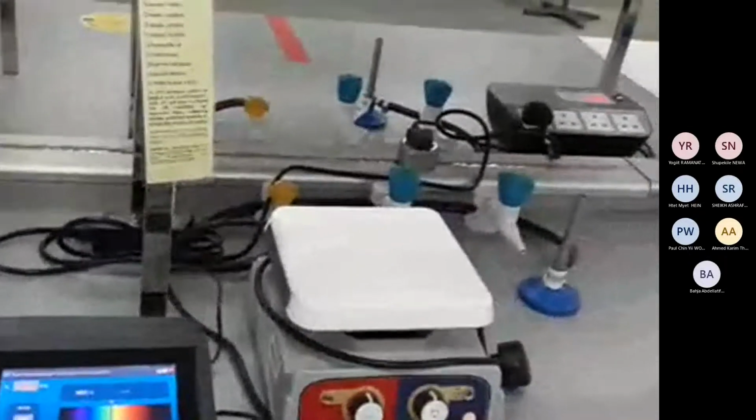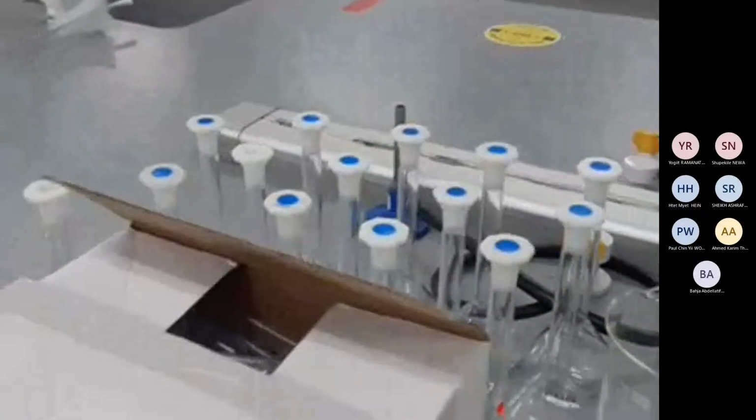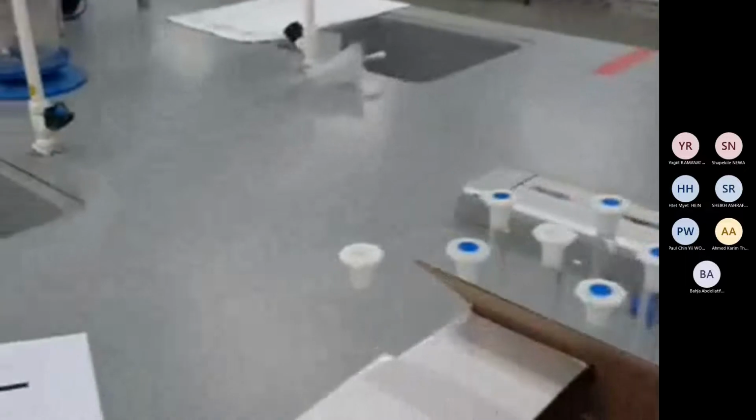This is the cuvette. You should put the cuvette. Where is the cuvette? Yeah, these are the cuvettes. Every group, take one. You can take more, but I want to show you one thing. So this is one, this is another one. Take this one.